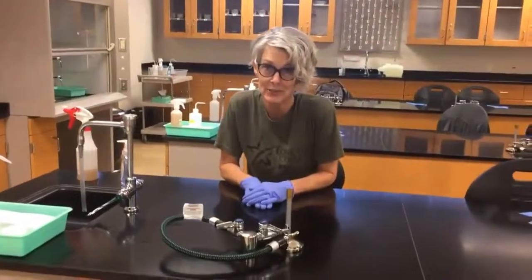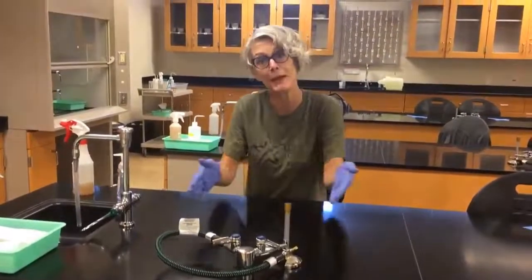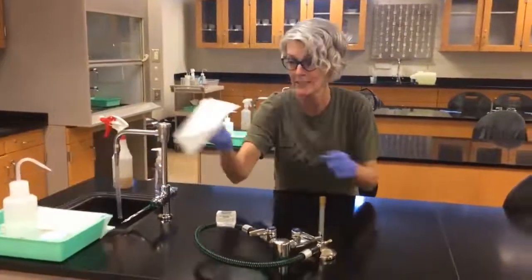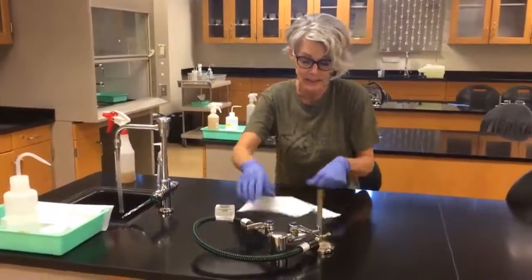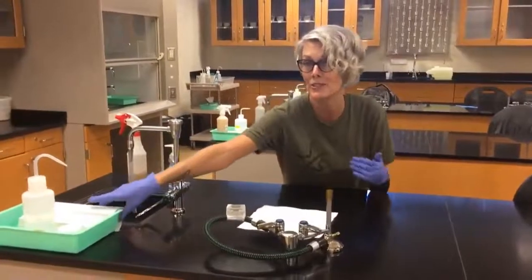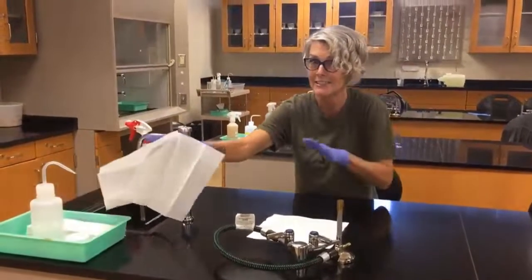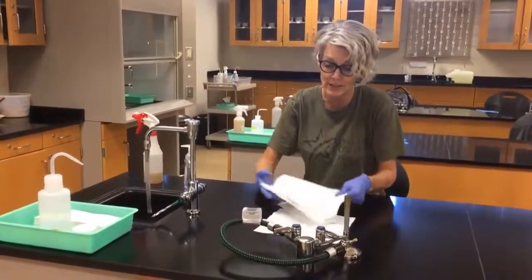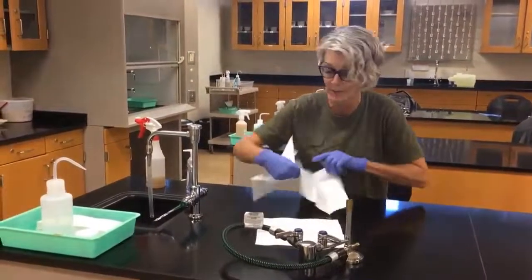If we're doing microscopy that day, the first thing you're going to want to do is to make a little mat for the microscope. The reason we do this is because these microscopes are big, and if you want to move them on the lab bench, the last thing you want to hear is it getting stuck as you're moving it. This way you can work in an environment that isn't going to be harmful to the microscope.